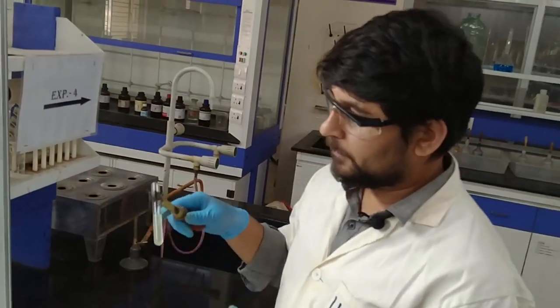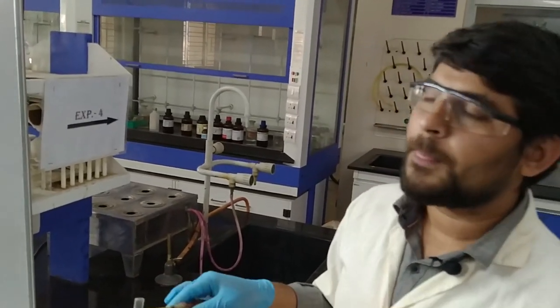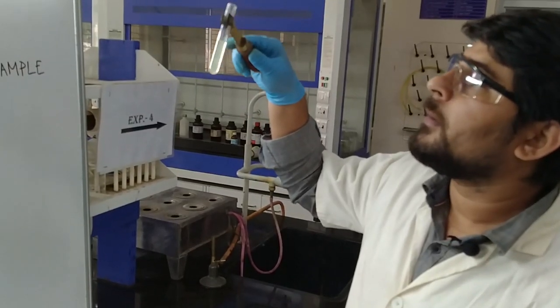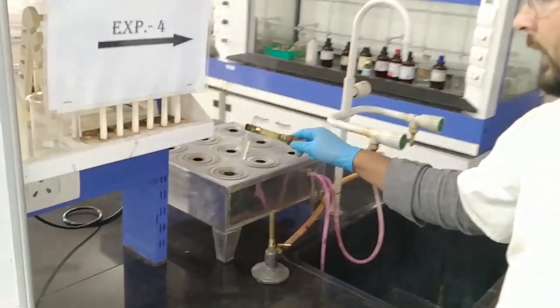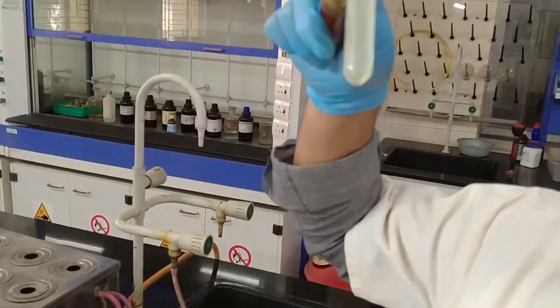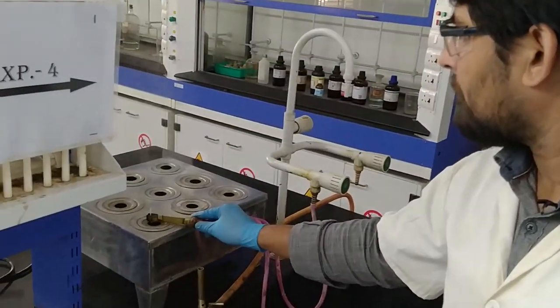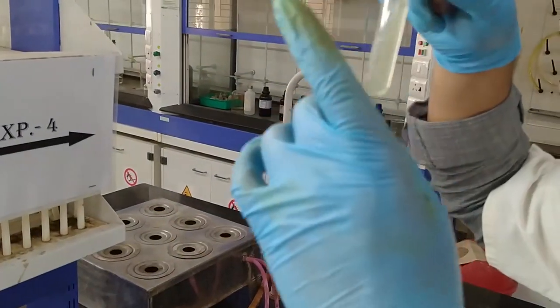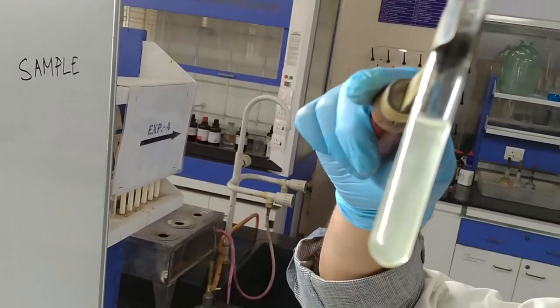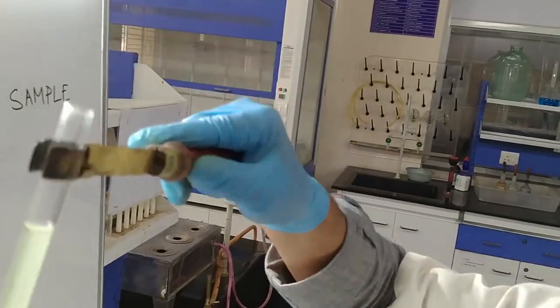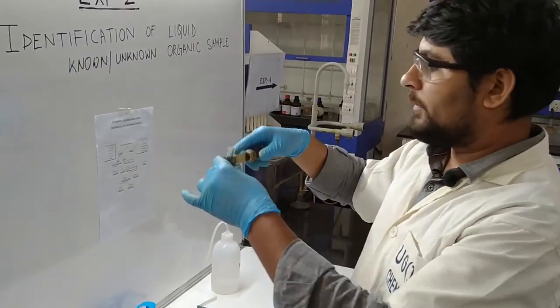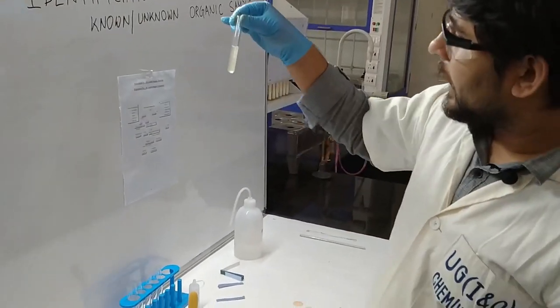Now we have to heat this in a hot water bath very carefully, because for the iodoform test, if you overheat it, the forming precipitate will dissolve. Above 60 degrees Celsius, the temperature can dissolve the precipitate, so handle carefully. I am going to put this one in the hot water bath for just a while. Now, precipitation is formed inside the test tube, but it takes some time for the precipitate to settle. So, you can consider this a positive iodoform test. I will keep this in the test tube stand and let it settle, then show you again.